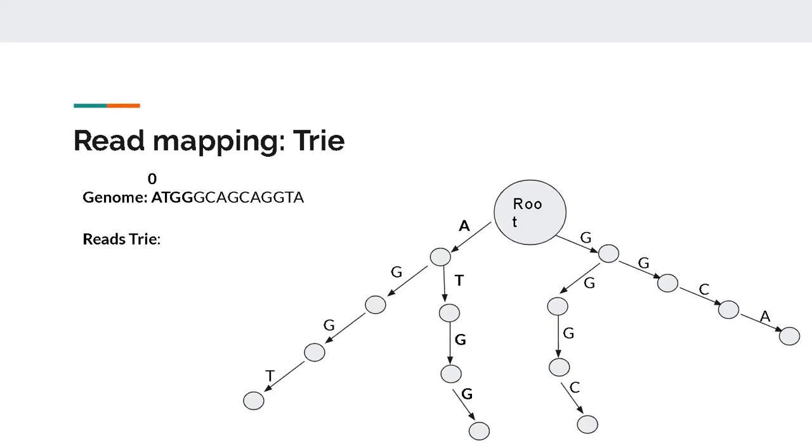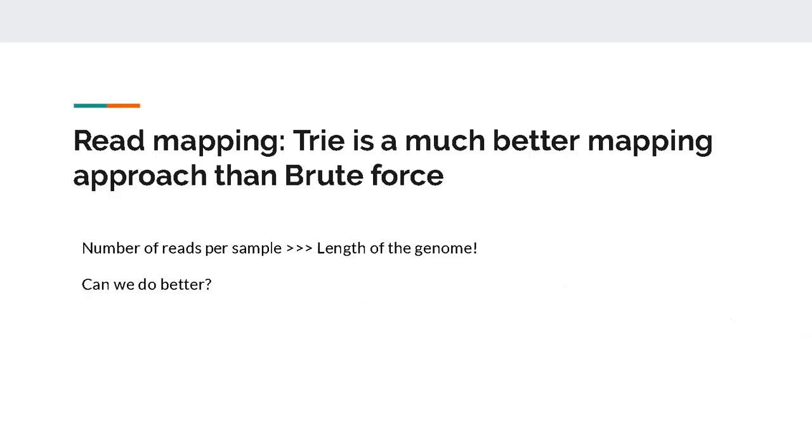So now remember, because of this, this would only take an amount of time proportional to just the length of the genome and the biggest query length in your data structure, which will be much less as compared to the brute force approach.